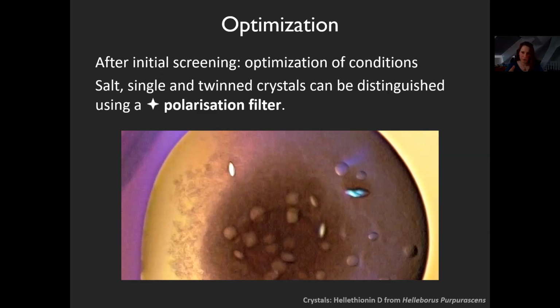So we threw away the first plate, I believe, and then we did another one and we got this stuff again. And then I happened to just rub in there with an acupuncture needle and hit one of those blobs, and it turned out they were solid. So we put a polarization filter on a microscope, and as you can see in the color difference, the stuff was protein.